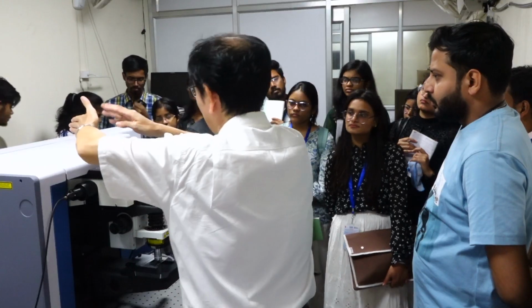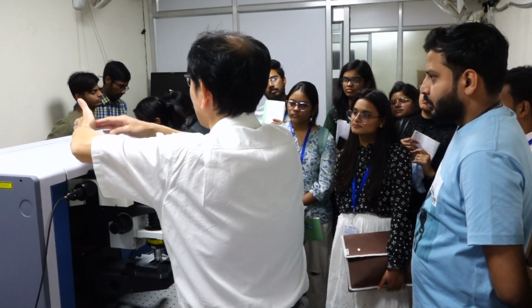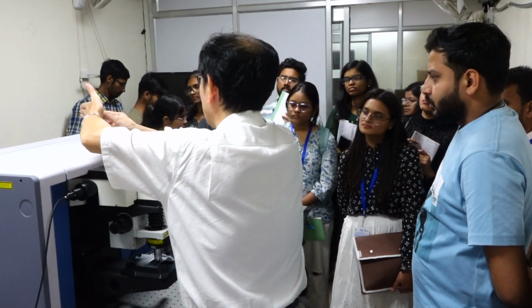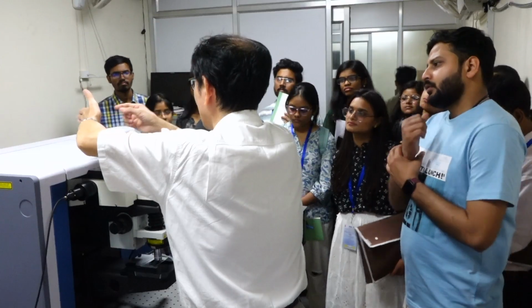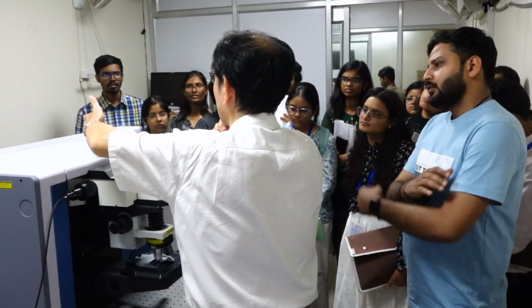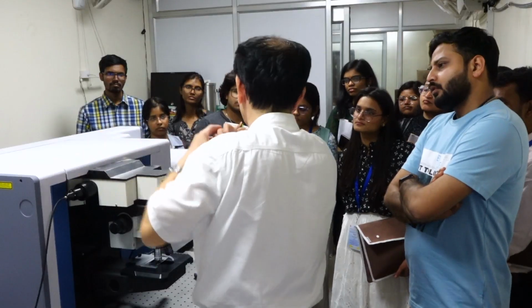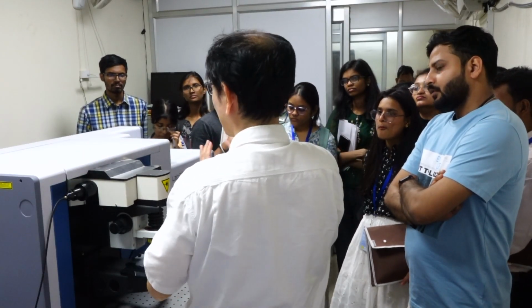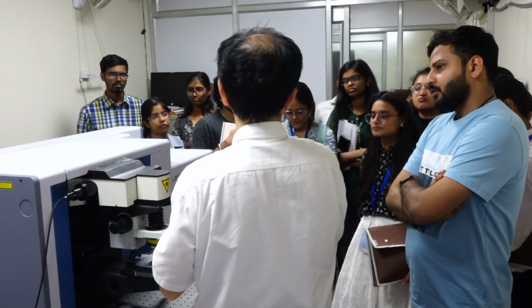But typically, this is not so. Typically, the cutoff is maybe 200 wave numbers or so. So if we want to measure low frequency Raman, another element is necessary. But 200 wave numbers is low enough for daily, typical use.